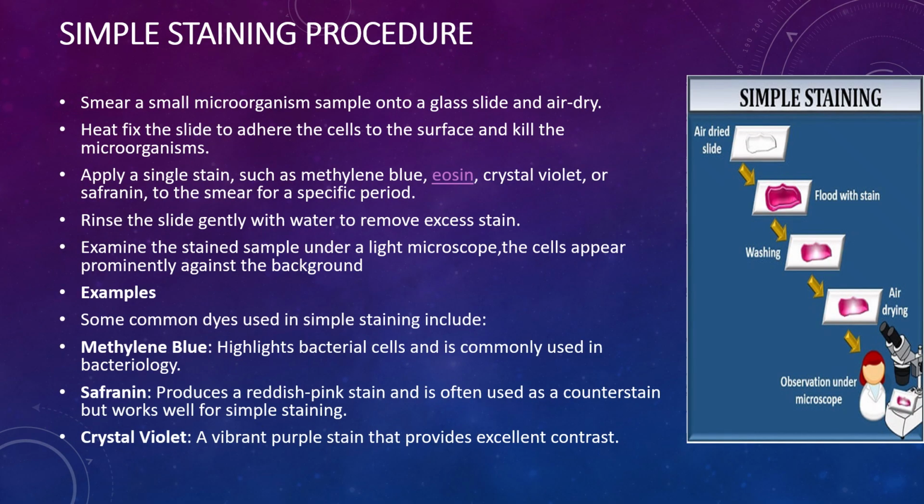Now coming to the procedure of simple staining, it is very simple. Smear the small microorganism sample on the glass slide and air dry. Heat fix the slide to adhere the cells to the surface and kill the microorganisms.